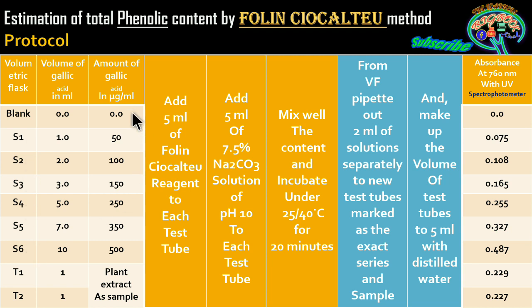These other two are unknown samples given for the estimation of phenol, so there is no mention of the phenol amount.